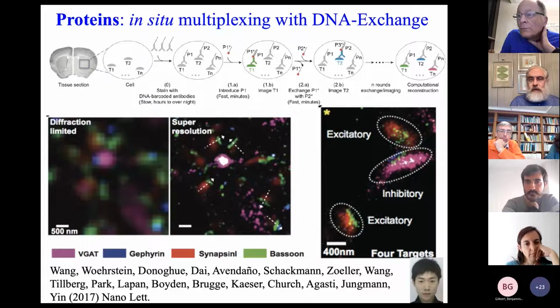This is subcellular resolution, and you just can't get this by treating the neuron as a sphere or taking the nucleus out of the neuron and hoping to learn. This is connectomics, and I think it's important.